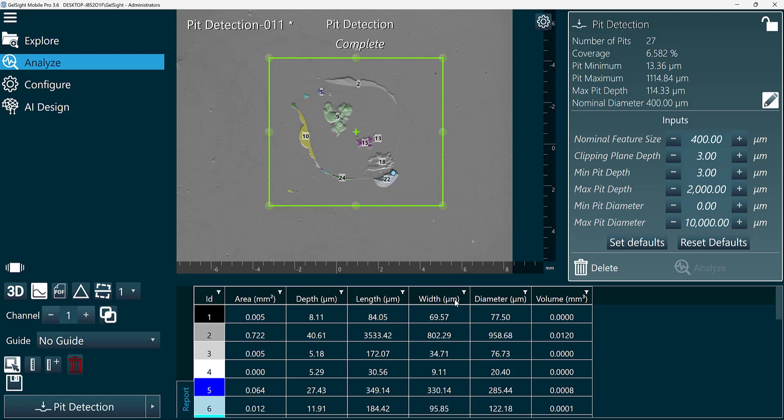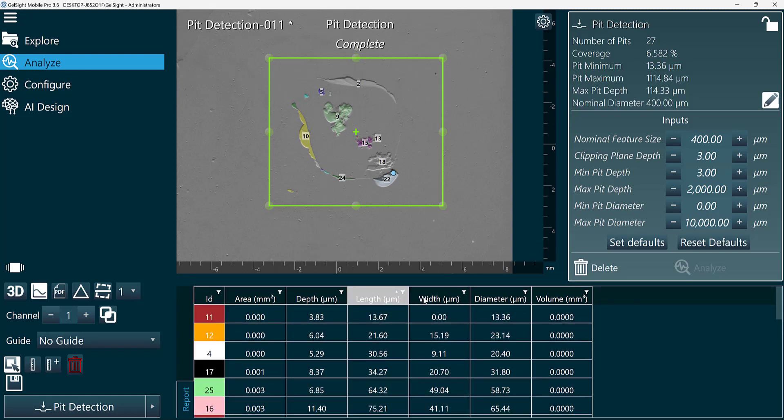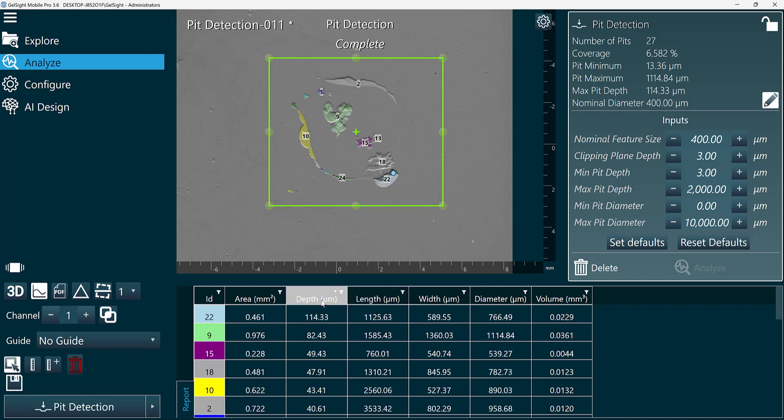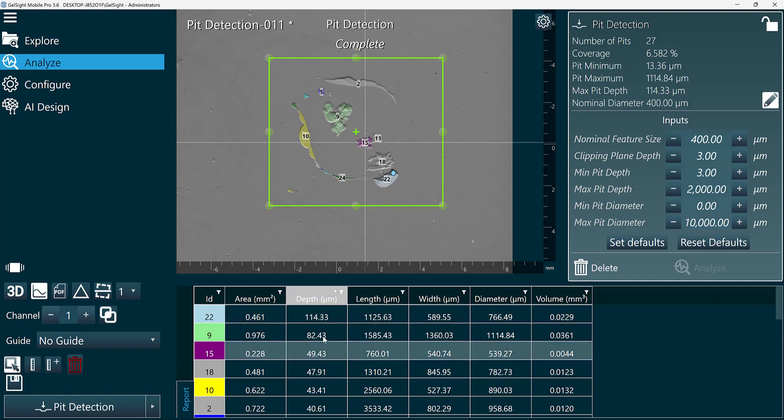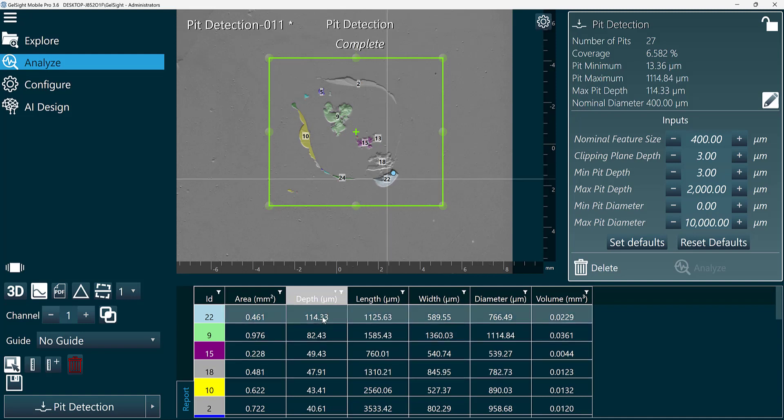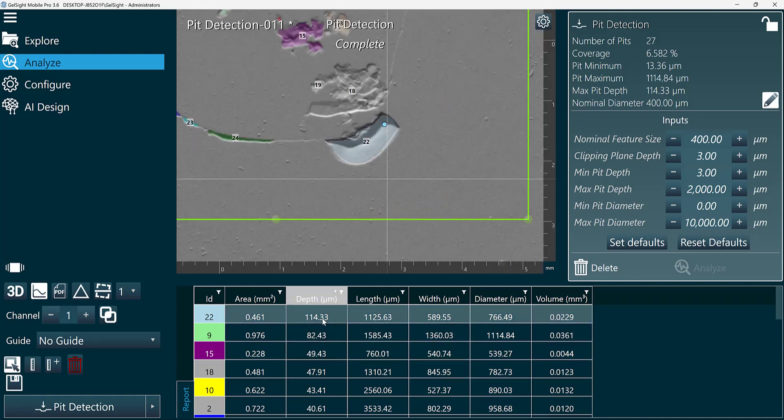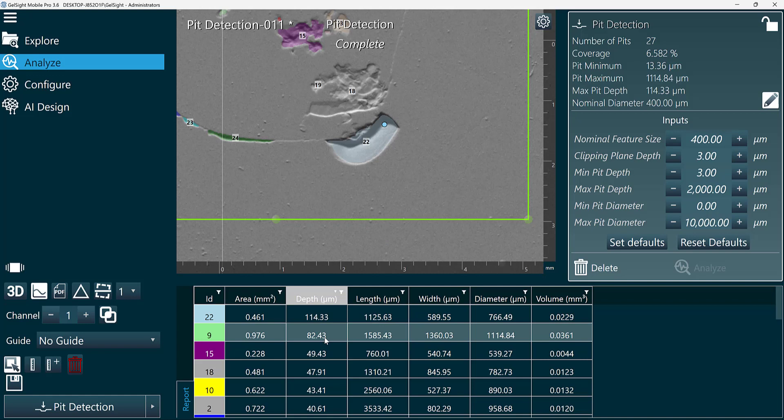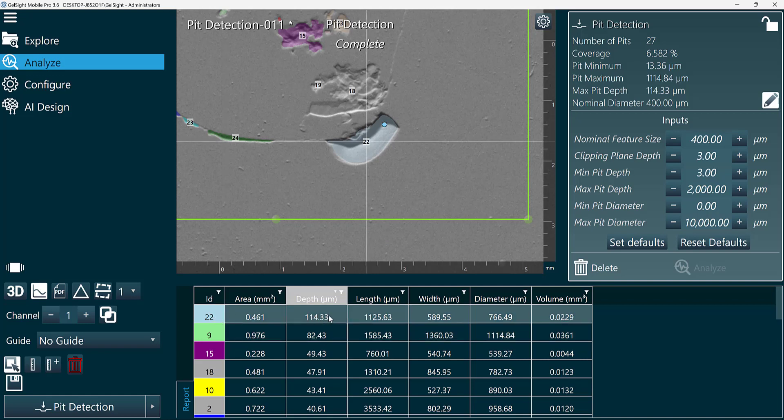We can now reference our table down here. We can sort the table based on the column headers. Maybe we are interested in the deepest pit. And we can even select a specific pit and view it in the scan. I selected pit number 22, which is the deepest pit in my field of view.